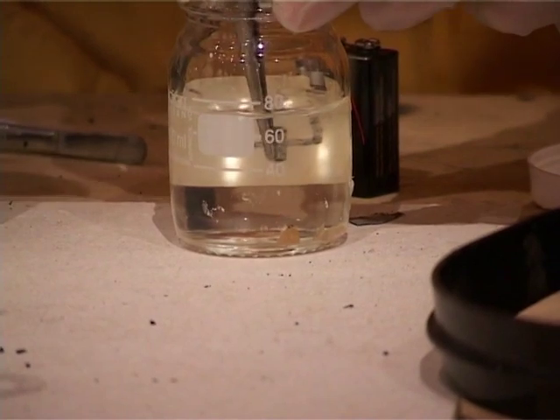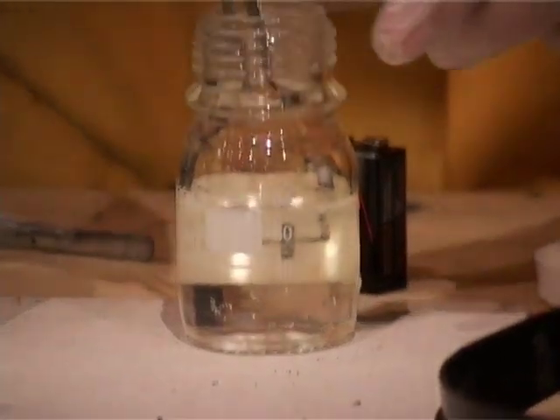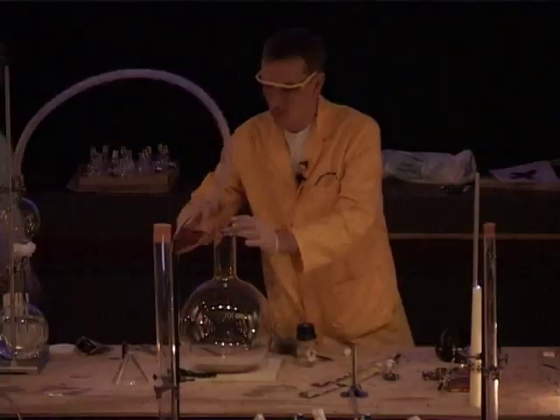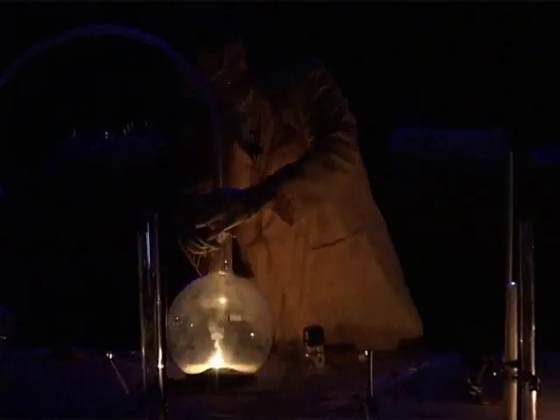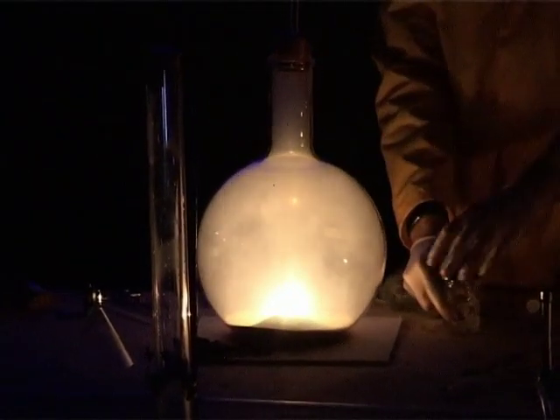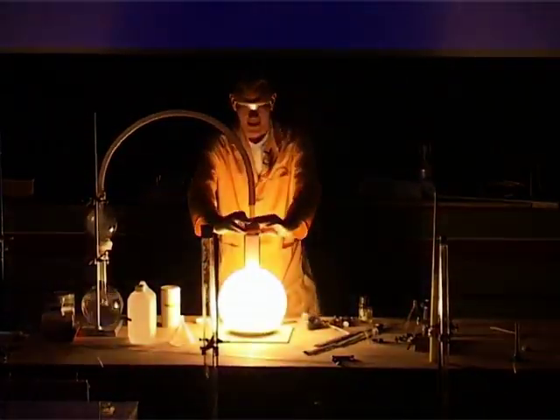So I'm just picking up a tiny little piece. So it's on the sand, and it's already caught fire. Oh, there we are. Look at that.